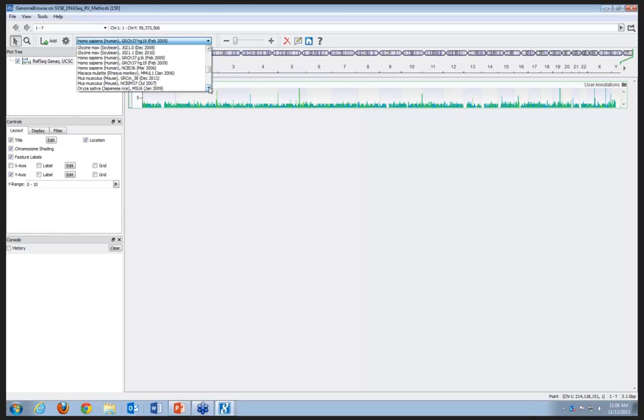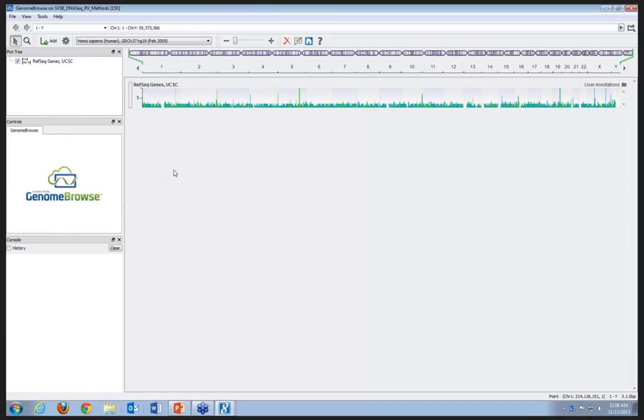When you get into higher ploidy numbers, we do have some issues with it. But in general, even if you don't see your species in this list, let us know. All we need to know is how many chromosomes it has, how long each one is, and if you happen to have access to the reference genome, it's incredibly helpful, but we can make sure that it supports whatever it is you need to look at. I noticed there was another question earlier about polyploid species, and we have some issues working with genotypes that can't be easily represented as diploid.